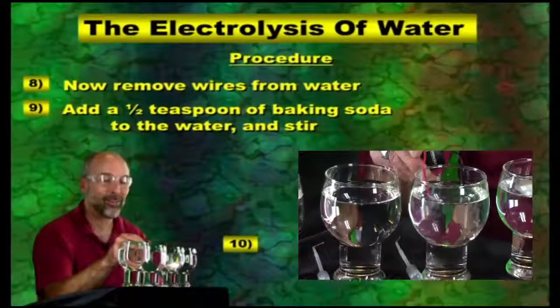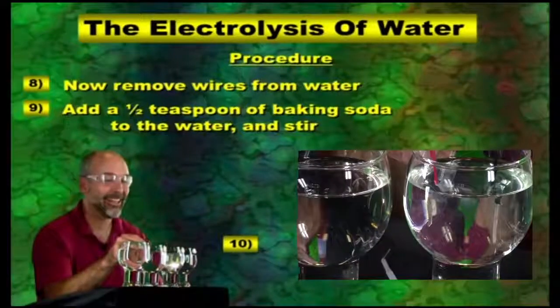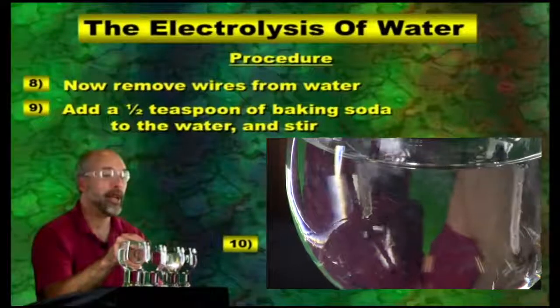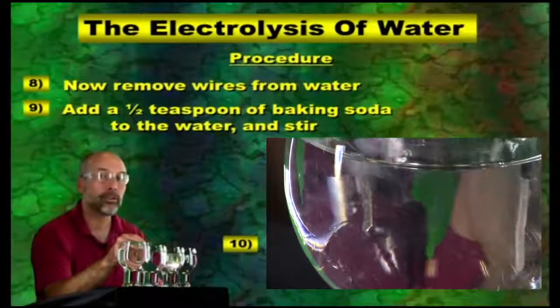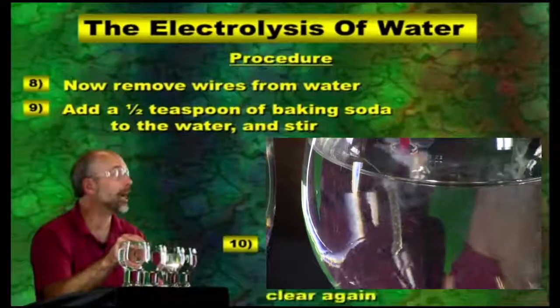In fact, look at it swirling still after I did my bit of stirring on this thing. You can definitely see something going on here. Wow, okay, I am seeing bubbles. Bubbles is one of the indicators of a chemical reaction. Do you know what the other indicators are? And remember, bubbles mean what? Gases are released. That's what's going on here.